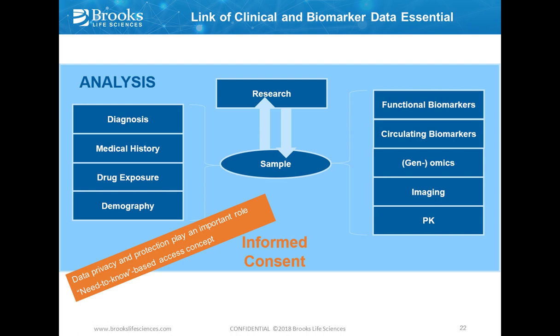Then linking clinical and biomarker data, we believe this is essential, to link them to the sample, to have the full data repository available for good research. To really have the view of what data I have available, and to have the opportunity to get this data for my analysis. Also, that needs to be established by the ICF. And then, of course, and that sometimes generates additional issues, I do research with my sample, and that research very often doesn't go back into the original clinical trial database or wherever your data are stored, but is more or less free-floating with the researchers that performed the research. And that may give you relevant additional information about your sample. You want to also include this into your data collection that is tagged to the sample.